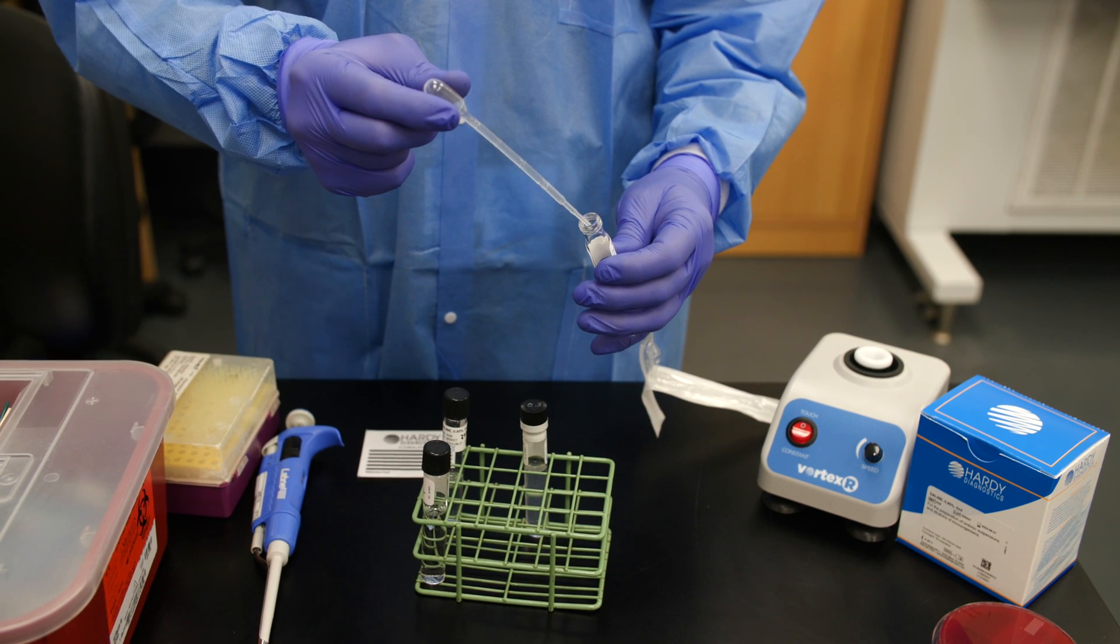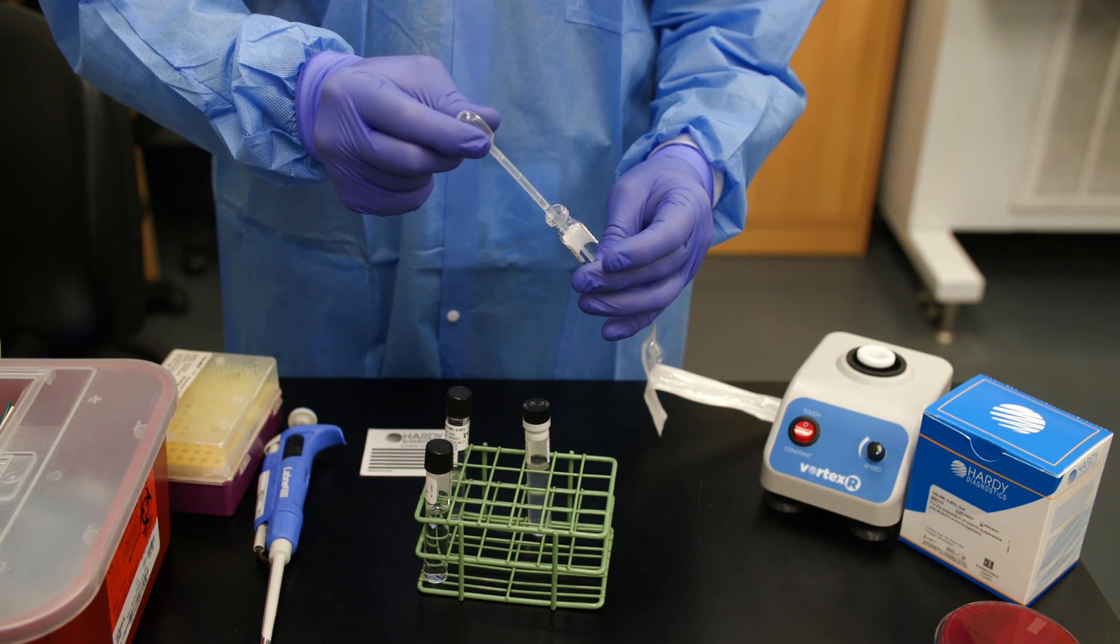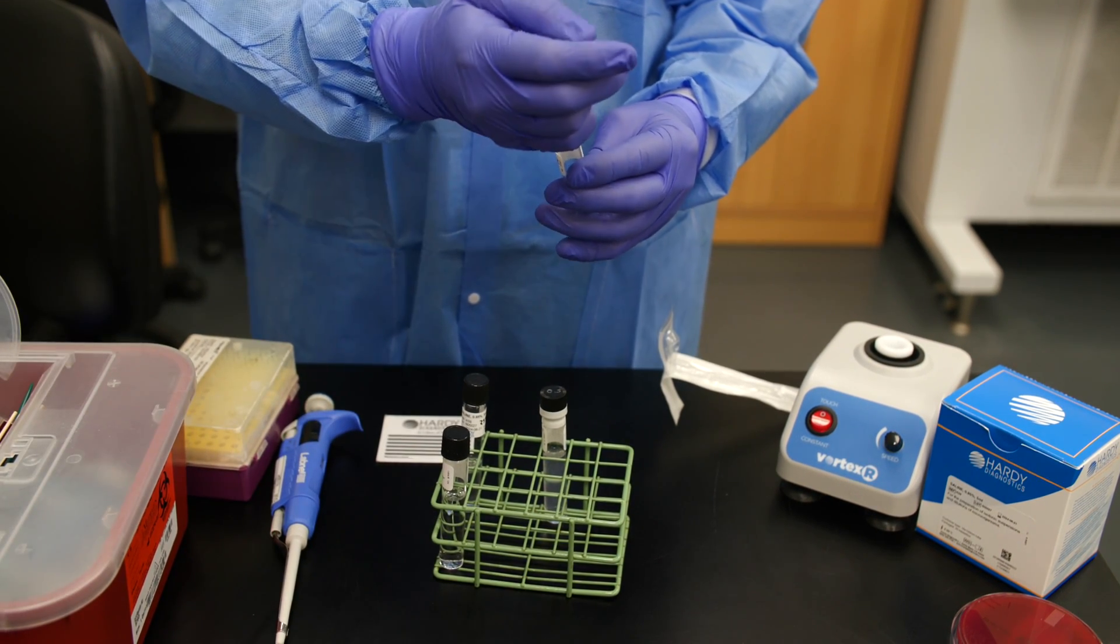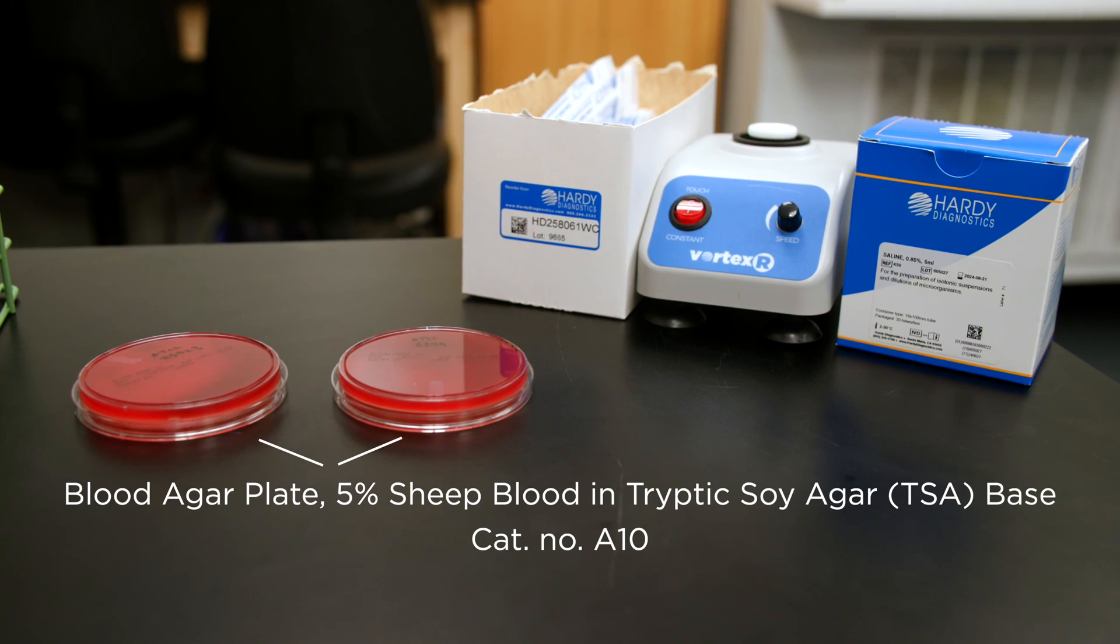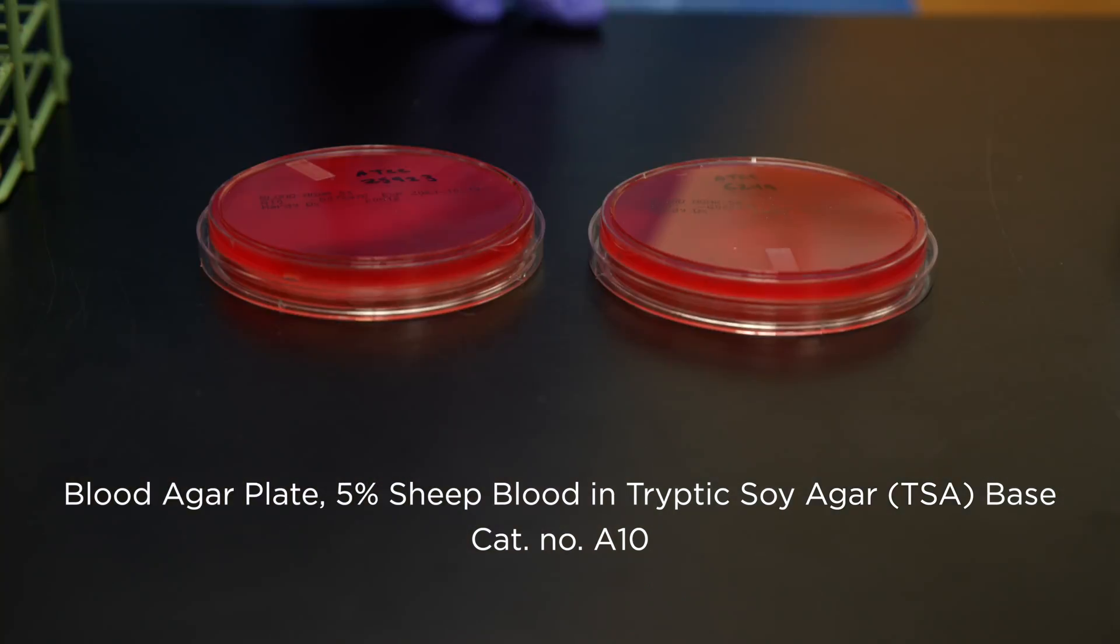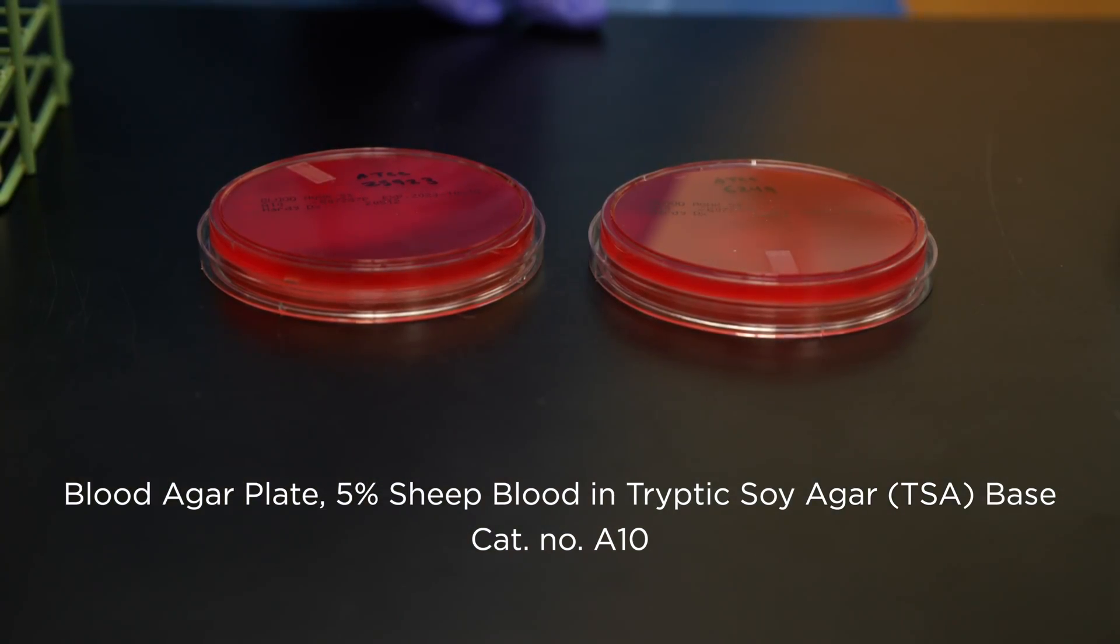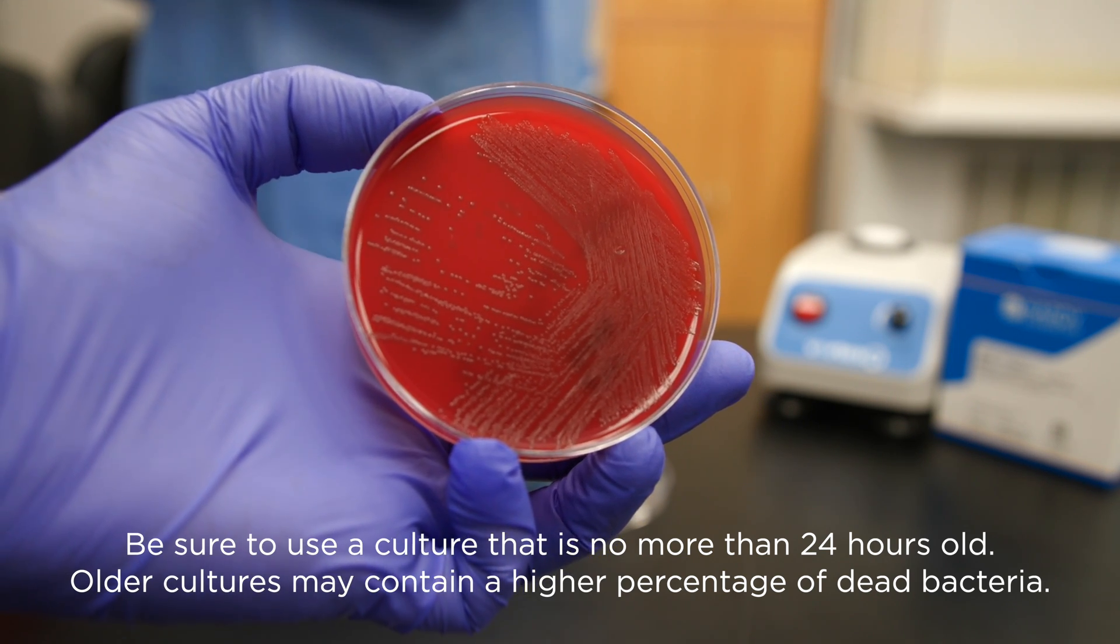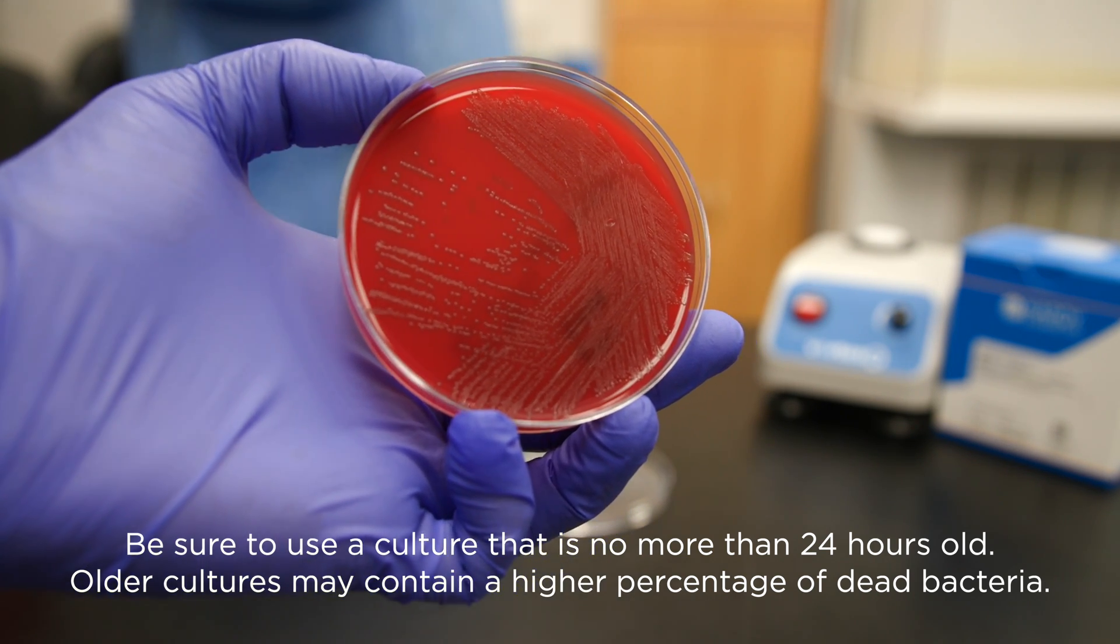Next we will cover how to prepare a bacterial suspension that is adjusted to a 0.5 McFarland using a pure culture. In this example the organism was grown on tryptic soy agar with sheep blood. Be sure to use a culture that is no more than 24 hours old. Older cultures may contain a higher percentage of dead bacteria.